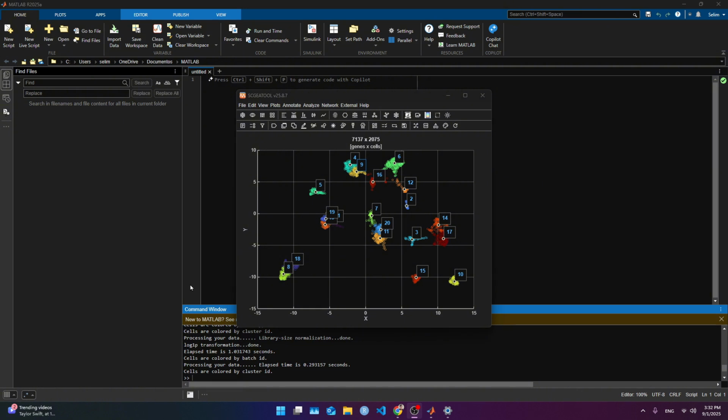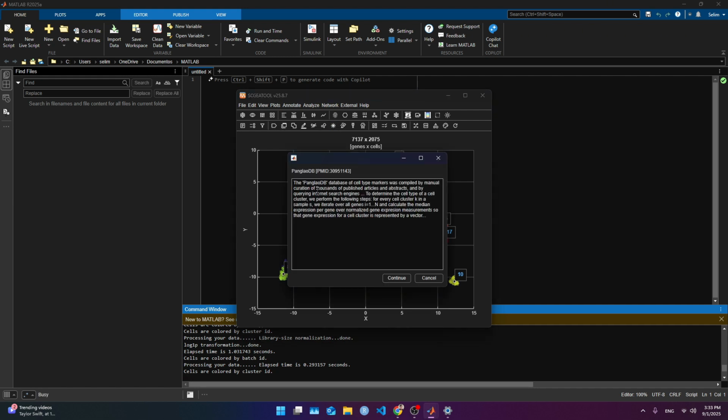All right, the next, beside the clustering, we have the cell type assign. So we are gonna assign the cell types utilizing a curated data set from Dr. Sai's lab. And here it is gonna utilize the curated by PangLaoDB. PangLaoDB is a really nice web page I'm gonna walk through later, but so far we're gonna just use this.